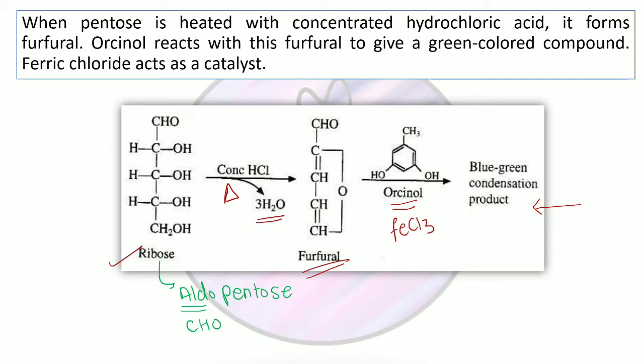now we know that ribose is a sugar which, when heated in acidic condition, undergoes dehydration, and the intermediate product condenses with the reagent to form a blue-green colored product. Keeping this idea in mind, now we can use the same method for the quantitative estimation of RNA. How?